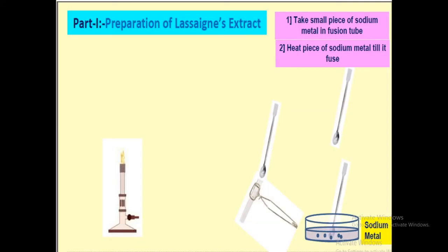In part one of preparation of Lassaigne's extract, we require a burner, a spatula, and a test tube, which is also known as sodium fusion tube, which is very small.